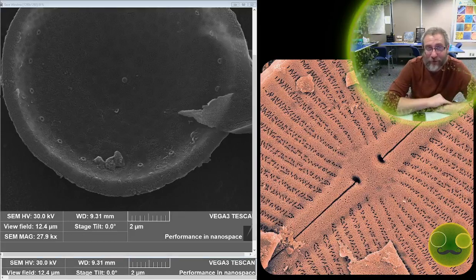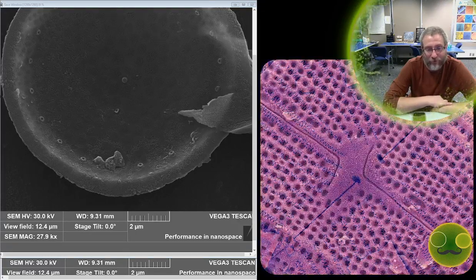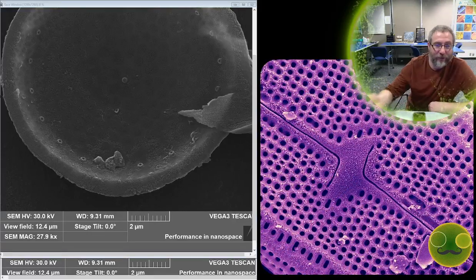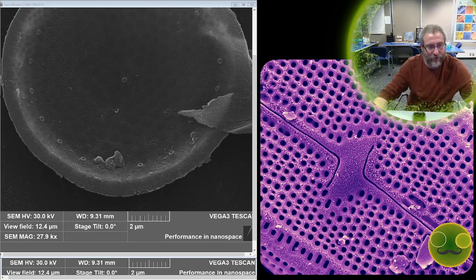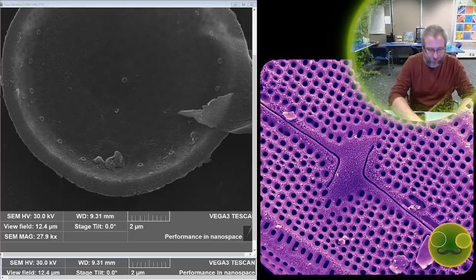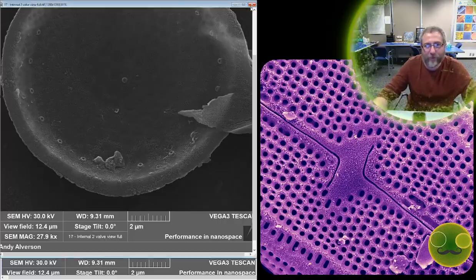So there's a little bit of prep time that I still need to do, rinsing the sample to try to get the salt water out. And then maybe next time, or maybe I'll just try to get it done before the weekend, or during the weekend, or next Monday or something. So if it doesn't work out, then I'll just have to have Andy send me some more of the material. So I collected this image, and it's been sitting here for a long time, fully developed, so we should probably move on.